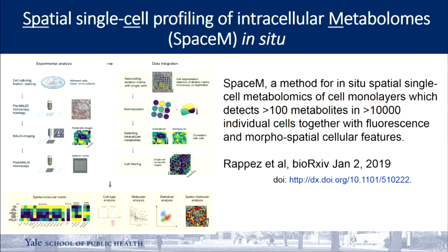When we talk about microscopy, especially when you get down to the single cell, you really need something that will tell you what the cell is and how you can distinguish it. Of course, you can get the single cell population. We'll discuss that. You can get a metabolomic signature that you can really distinguish in the cell population, then you can match it with the RNA-seq data. But essentially with this approach, I really liked it, and I strongly encourage you to pay attention to that.